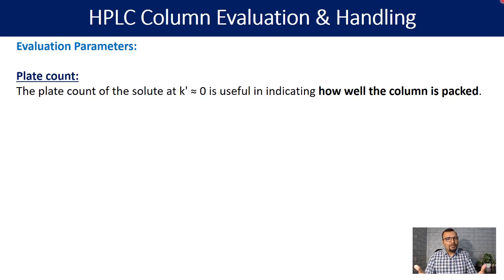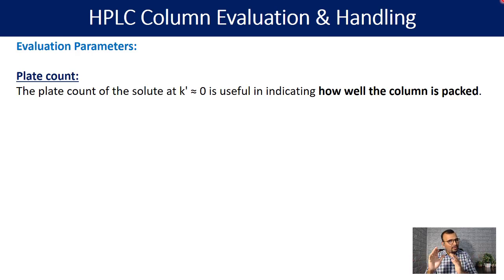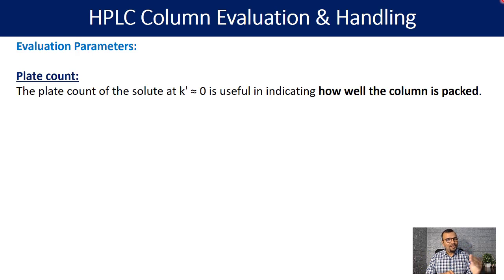When the column was new, the peak shape was very sharp. But as the column grows old, the peak shape becomes a little broad and that results in a drop in plate count. This indicates that your column packaging has started getting disturbed, and this effect has impact on the early eluting compound. Your late eluting compound may have an acceptable plate count, but the early eluting compound will get badly impacted. That is why we recommend a three-component mixture with one compound eluting early to understand your column packing health.